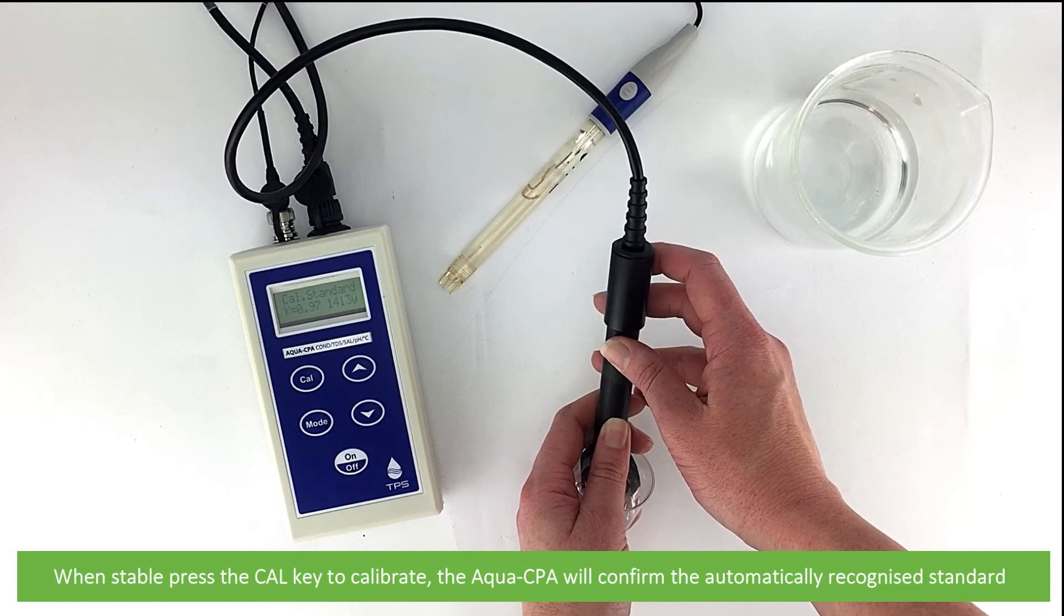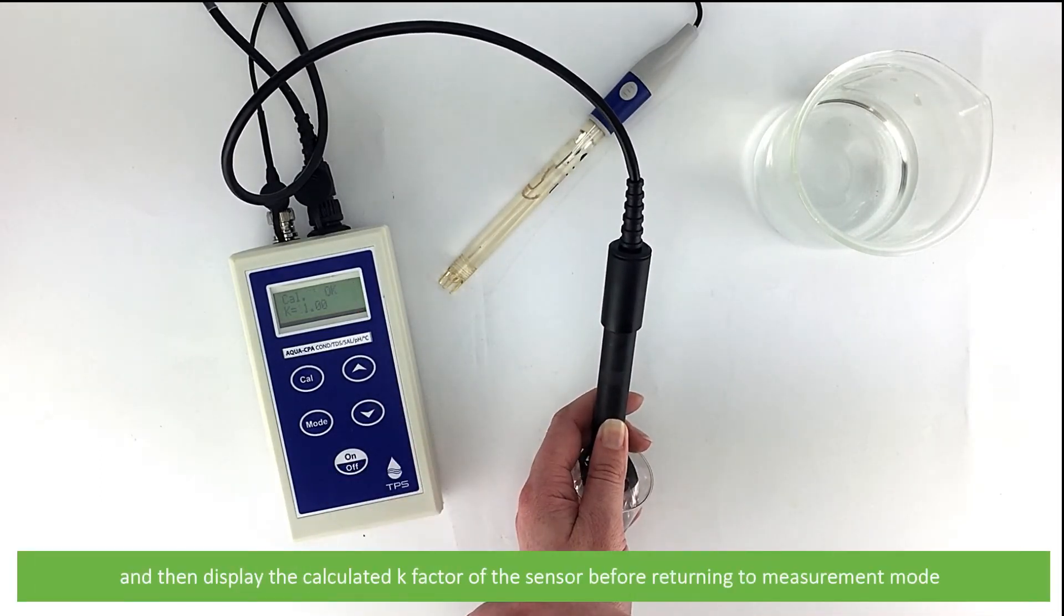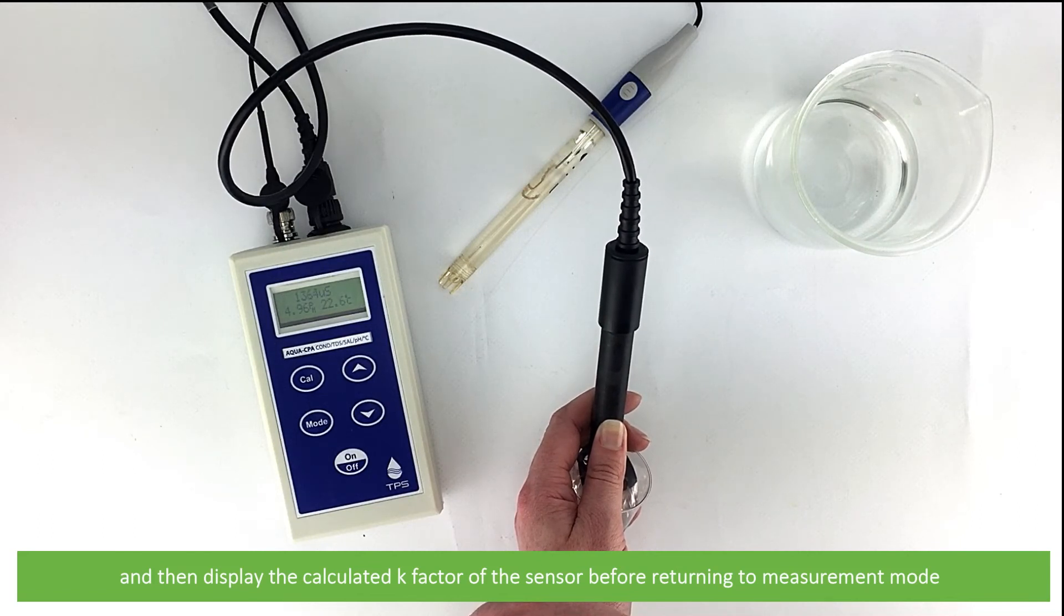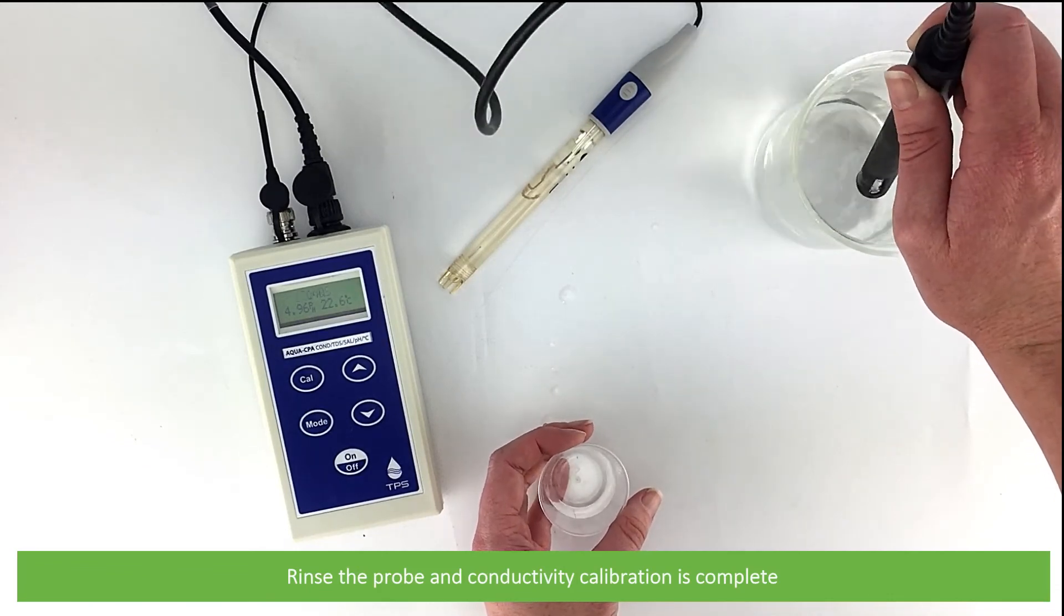The Aqua CPA will confirm the automatically recognized standard and then display the calculated K factor of the sensor before returning to measurement mode. Rinse the probe and conductivity calibration is now complete.